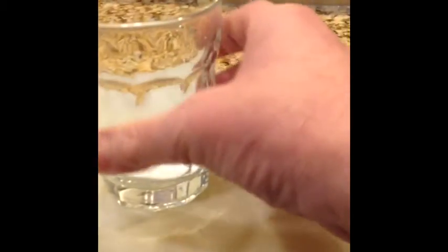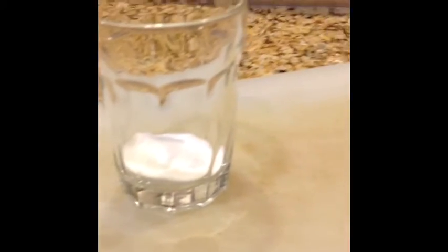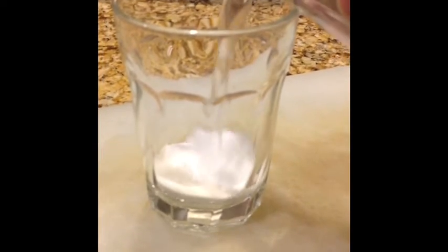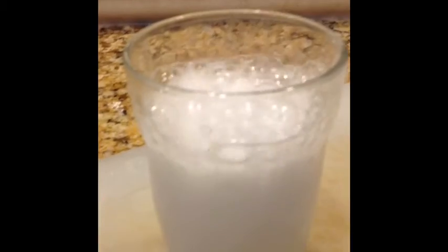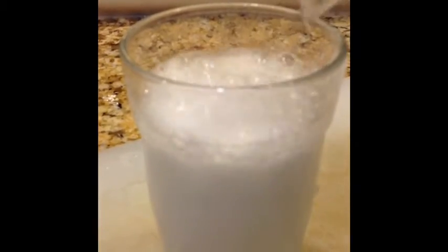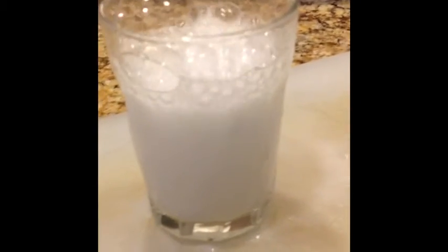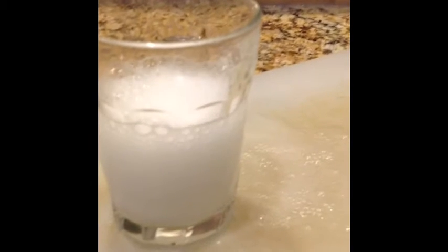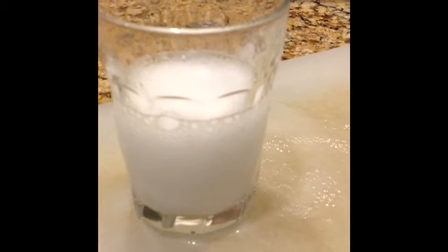We have light. We have heat. We have sound. And one of the last ones is, here we have a solid, and we're going to mix it with a liquid. And oh my goodness, what happens there? A gas is given off. Nice. So a gas is given off. That is also a sign of a chemical reaction.